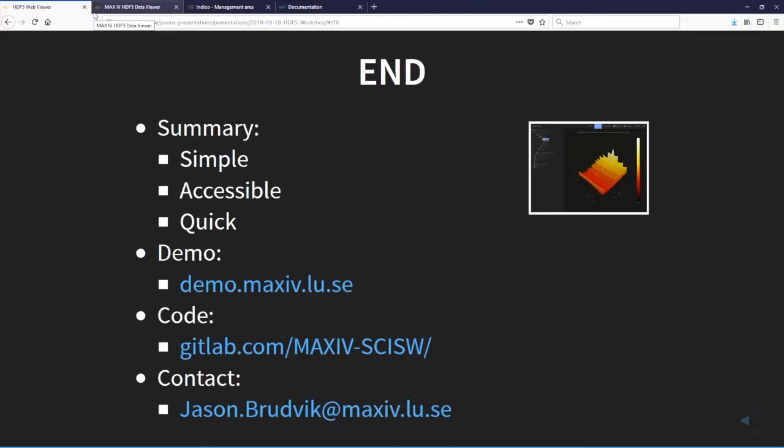And if you want to write something new that you want to keep maintaining, because data will move to HDF5, I think you'd better take HDF5 data as input rather than the other formats. So there are two ways we provide. One is a command line tool, which takes the SPEC files and converts them to something that is HDF5 and NeXus compliant with the guidelines we follow at ESRF. And then you can add all your image data within it.